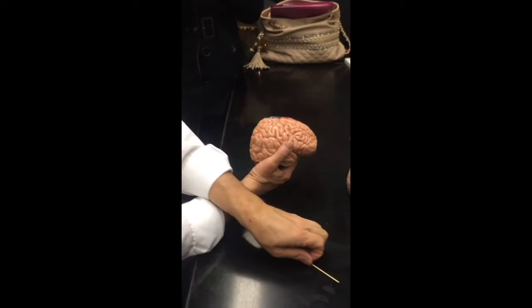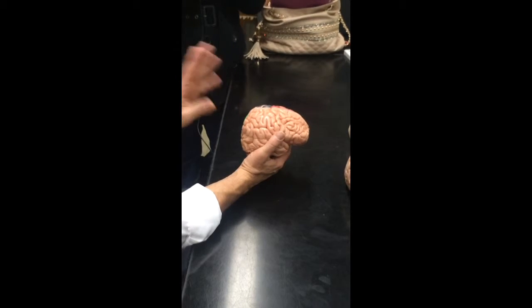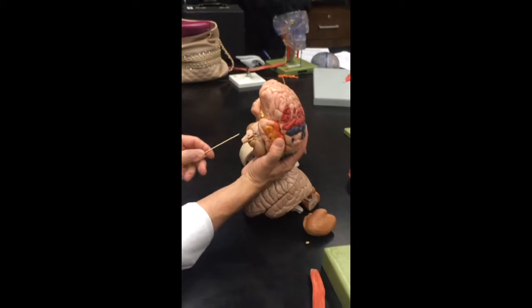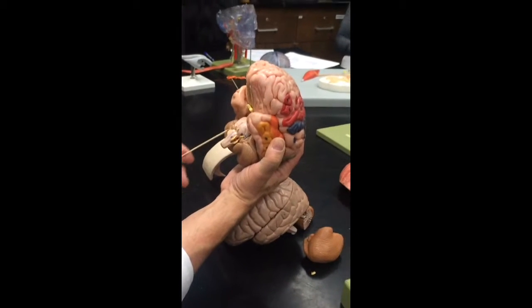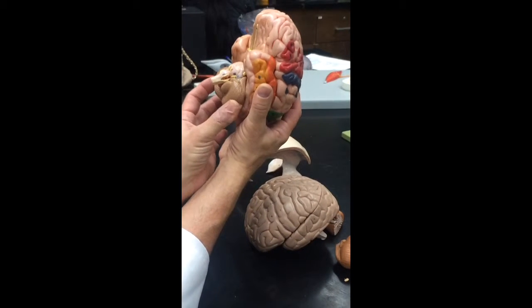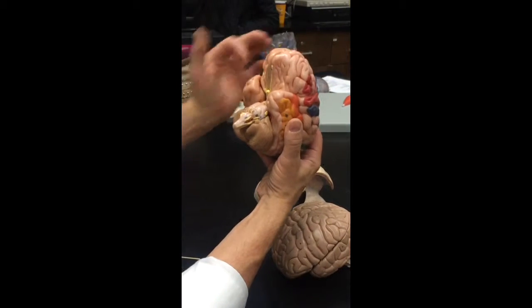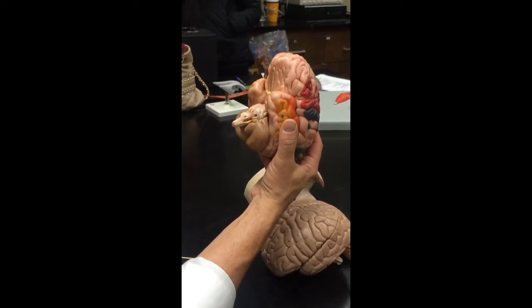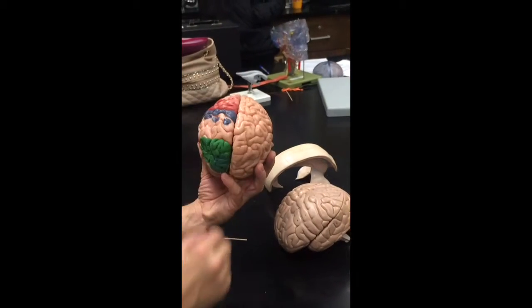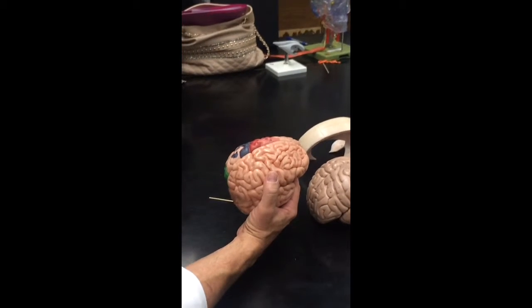This will be a dissection of the brain. So I just want to remind you, we're going to do the brain in 4 parts, like a mushroom. If we kind of looked at this real quick from the underside, this would be like the stalk of the mushroom right here. This is the brain stem. Then behind the brain stem right here is the cerebellum, where my thumb and forefinger are. Above the brain stem, but before we get to the cap, inside here is the diencephalon. I'll show you that. And then the big part of the mushroom kind of hanging over the whole stalk, this is the cerebrum. Okay, so let's start with the cerebrum first.